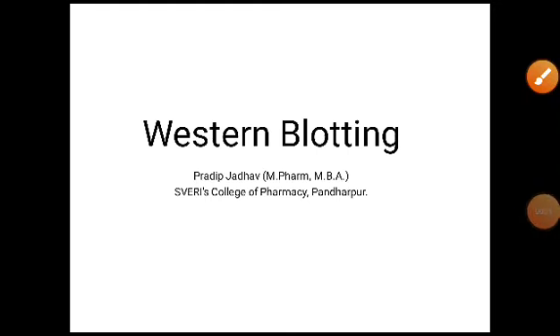Western blotting. Today we are going to see about Western blotting. Towbin in 1979 developed the Western blotting or protein blotting to find out the newly encoded protein by a transformed cell.